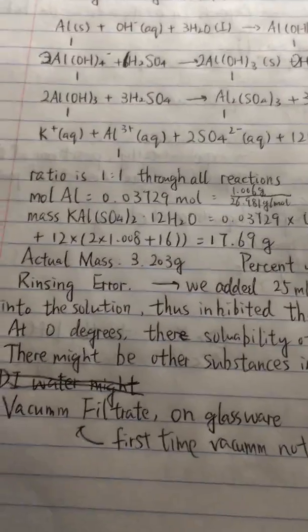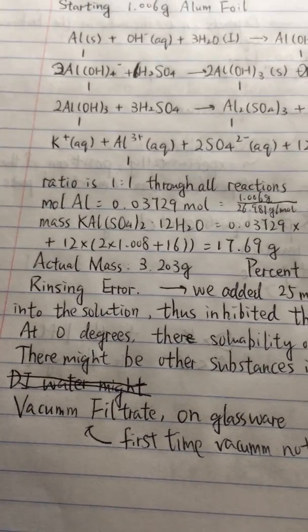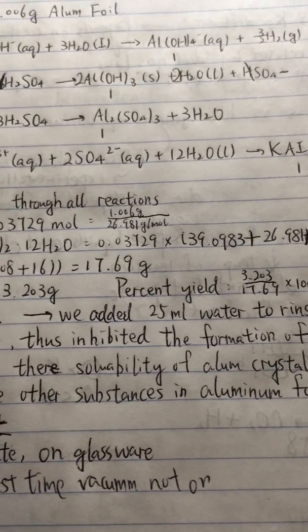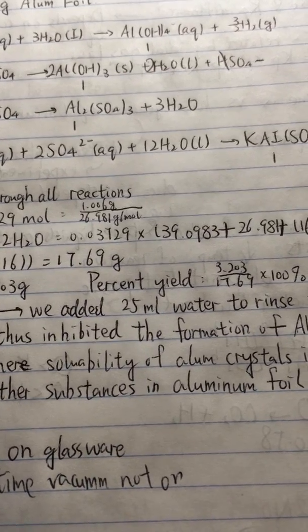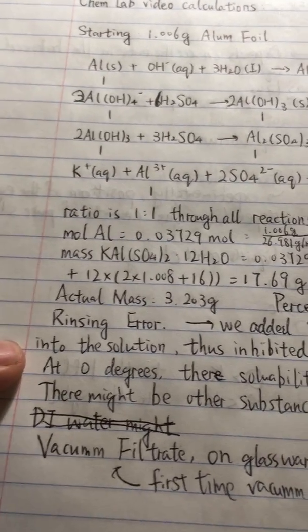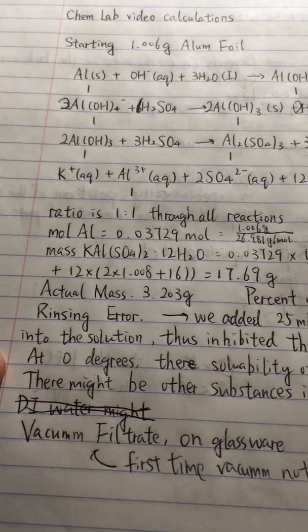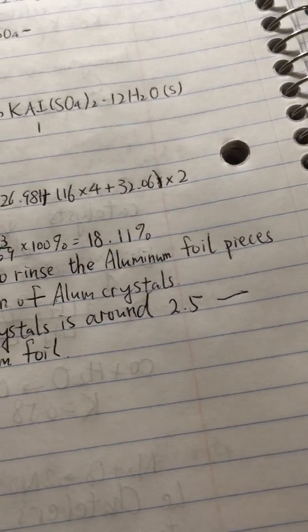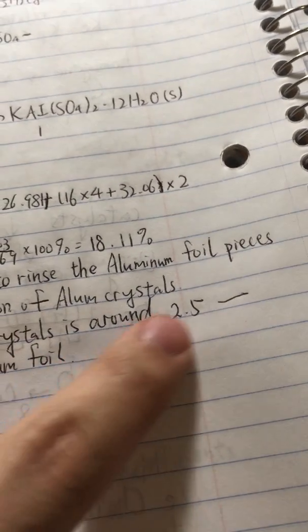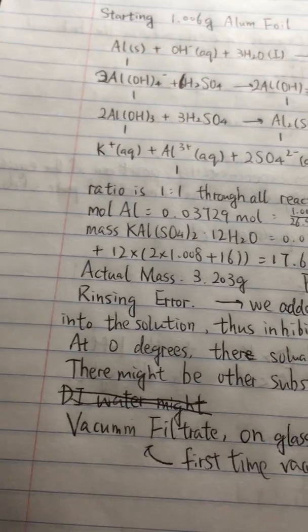The reason why we get such a small yield is the rinsing error. When we were doing the experiment, we added 25 milliliters of water to rinse the aluminum foil pieces into the solution, and that inhibited the formation of alum crystals. And at 0 degrees, the solubility of alum crystals is around 2.5 grams per 100 milliliters of water. I should elaborate on the paper here.